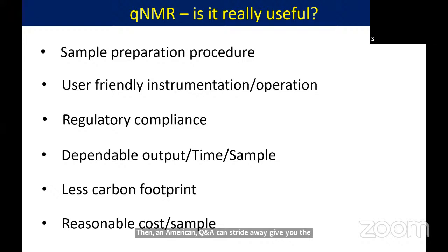Let us say if you wanted to go for HPLC, we usually don't prefer the extract to be run on an analytical HPLC column because an extract contains more than 100 compounds. Some of them are highly non-polar, some of them are highly polar. So your column is going to be damaged if you run crude organic plant mixtures. But in case of NMR, you simply have to dissolve the sample in appropriate deuterated solvent and run the proton NMR.